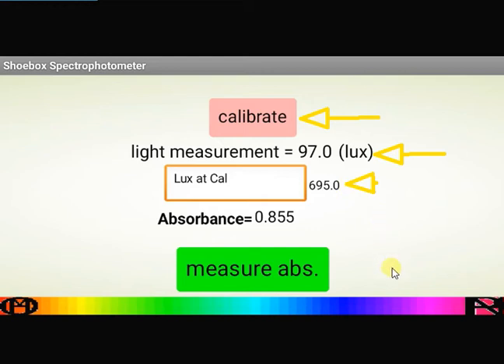Then you've got the measure absorbance button. So once you put your sample in, you can press measure absorbance and it will do the calculation based on that measurement and the calibration measurement to display this absorbance value.